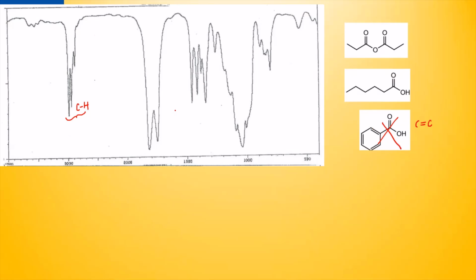Now, this is very unique. We've not seen a giant tooth in the middle of this. And this is looking interesting. We got 2 peaks. One all the way somewhere towards the 1000. That's massive. We've not seen anything this massive at the 1000 mark. And then we have not seen a giant looking tooth-like thing in the middle of the graph either. So this is unique, right?